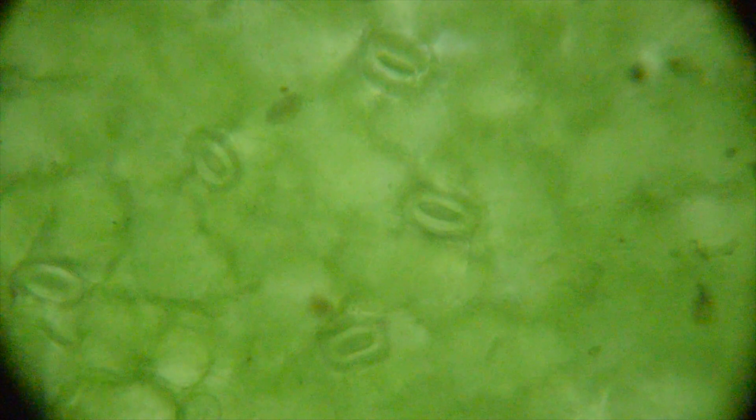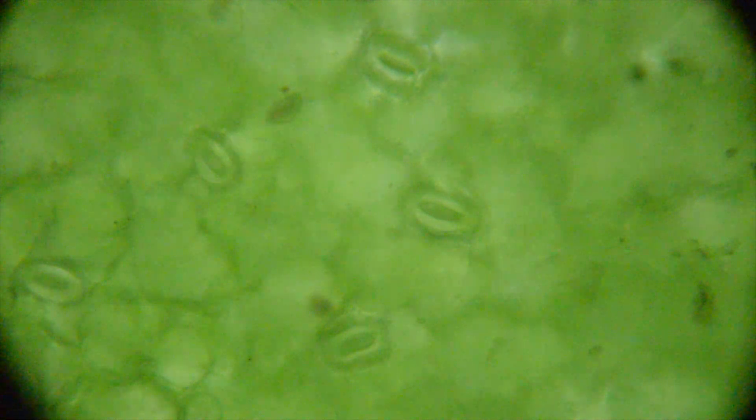All terrestrial plants have stomata, but most aquatic plants actually don't. You can see a pretty good visualization of stomata. There are also more stomata on the underside of all leaves compared to the top side. I'm not quite sure as to why that happens, but it is true.